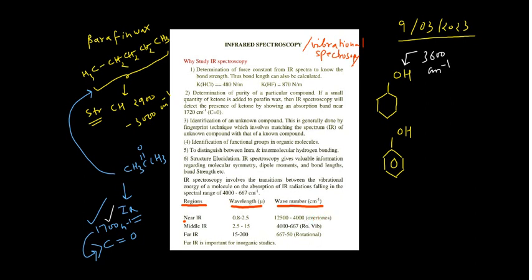See, in IR spectroscopy you have the fundamental bands, you have the overtones, you have the hot bands, right? All these different kinds of bands are there. So when you have the overtones, then definitely the range would be like that. But we are not very interested in the overtones when we interpret the IR spectra, because these overtones are of very low intensity.